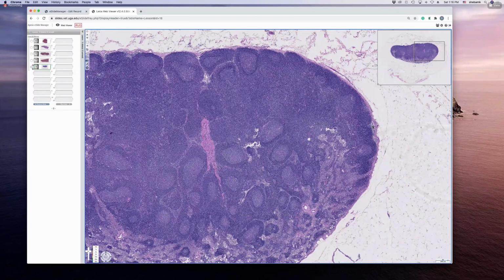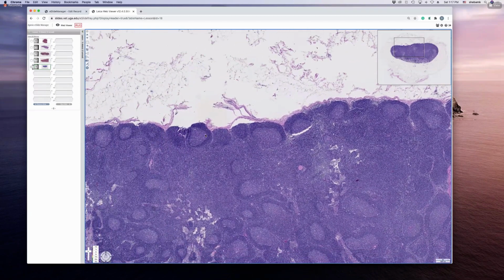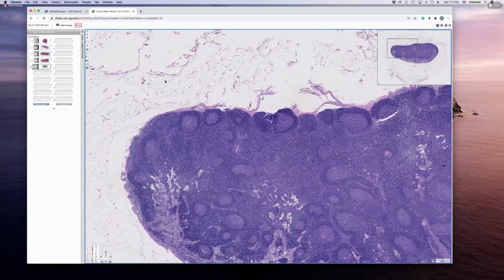There is a sinus under the capsule, into which lymph vessels that drain into these lymph nodes enter. What are the lymphatic structures that enter the lymph node called? They come from the surrounding tissue. The lymph node acts like a local police station, so all the roads from the surrounding tissue get access. Is it the hilus?